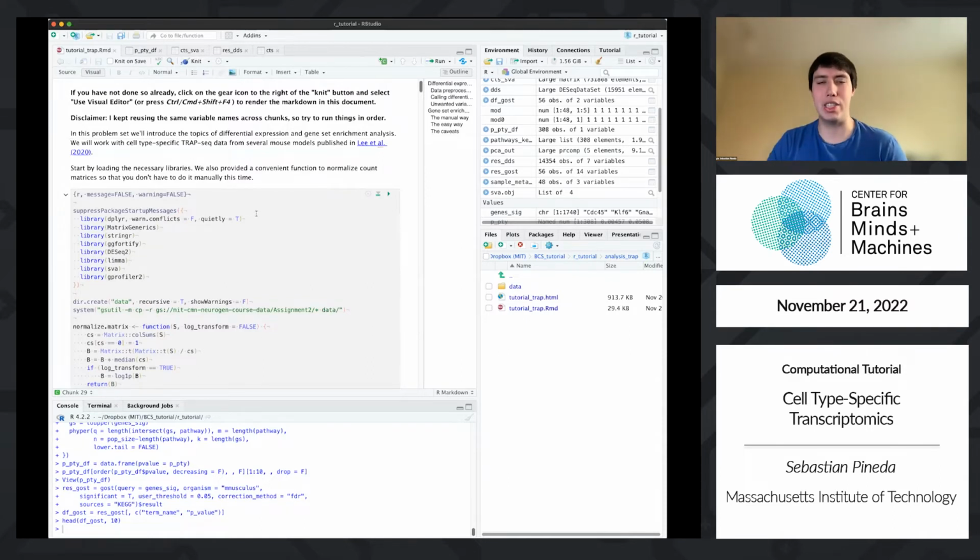What RNA-seq does is it's not really a terminal experiment. It's not really the thing that you're going to publish. Other people do. It gives you leads on what to pursue, right? So you get these large tables of results that are basically ranked in order of importance. The biggest change has the smallest p-value, so maybe you should go after this gene first. So RNA-seq is really an exploratory tool more than anything. But it's also something that's very easy, very accessible.